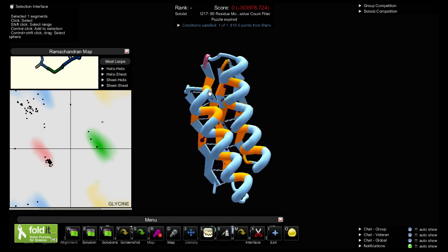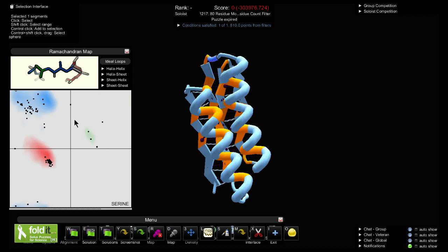It's rotating in the plane of the screen. So in order to fix the rotation, I want to find another segment that I can move that's approximately perpendicular to the plane that I want to rotate it back through. The closest segment I can find is the neighbor of the glycine — this is a serine. When I click on the serine in selection interface, it highlights the serine and also highlights the dot in the Rama map that corresponds to that segment. If you think of each segment like a bendy straw, when you move a dot in the Rama map, you are not bending and unbending the bendy straw — you are rotating the bendy straw like you're twirling it between your fingers. So if I were to twirl this segment a little bit along its length, that would rotate this half of the protein one way or the other.